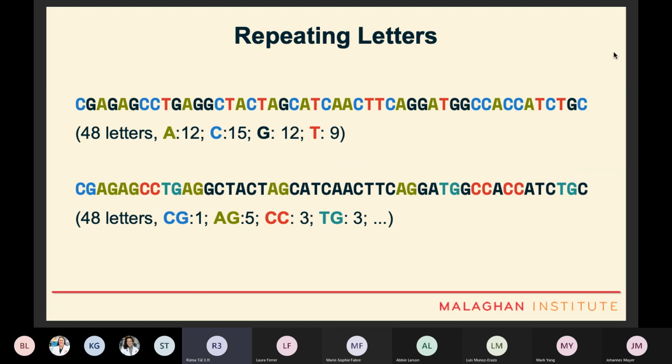As these fixed length subsequences get longer, the ability to distinguish the individual repeat sequences diminishes. But I realized that the location of the repeats is enough to identify what was repeated. In that case, I can use dots to represent the repetitive bits of a sequence. If my dots are too dense or too sparse, then I can just adjust the length of the sequences that I'm looking for to make images just the right amount of interesting. So I started thinking about how I would visualize that repetitive structure.